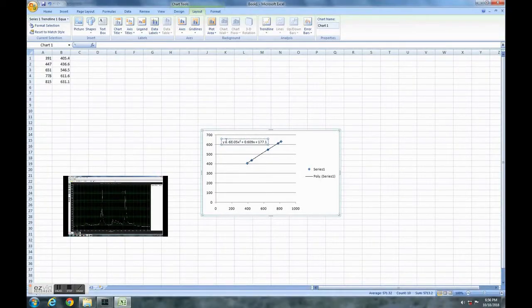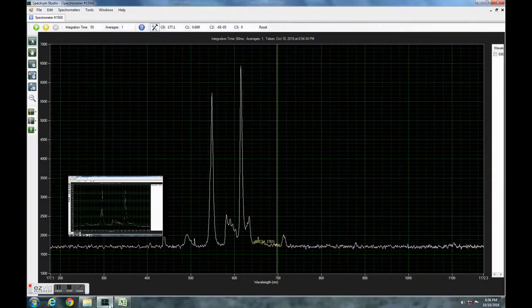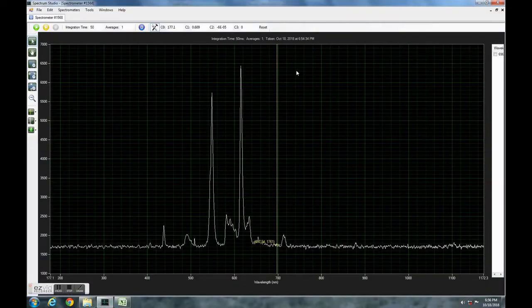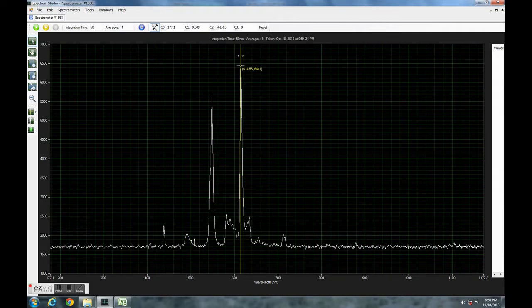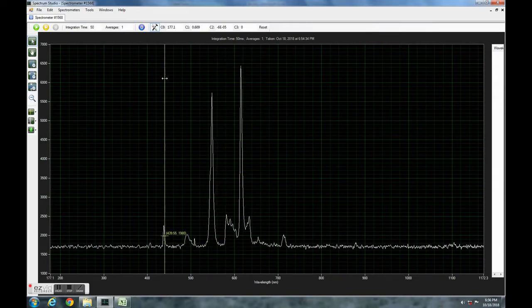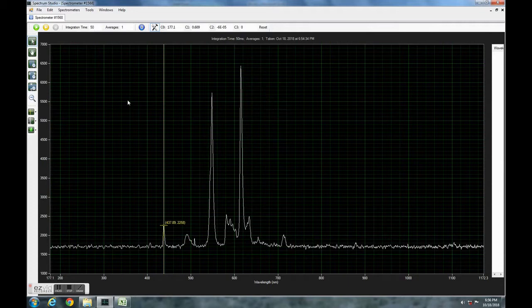So I already have a video on the calibration. We can see the spectrum is a lot broader than before. We can see on either side of the visible area closer to infrared and ultraviolet, which is what I wanted. So I'm pretty happy with this.